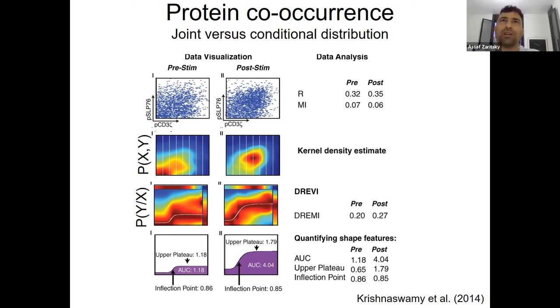So when we talk about heterogeneity, when we talk about unique subpopulations, this is in the context of cell biology, right? When we want to look at the unique subpopulations, it's very important to be able to identify them and say how they act. But it's also a good visualization for any data. When you see this type of data, you can think about using this trick. For me, it was useful multiple times.